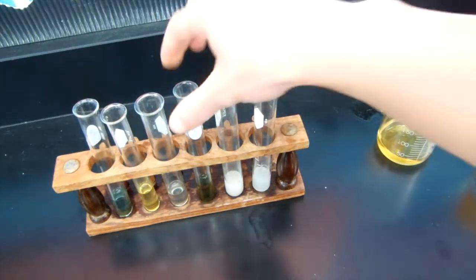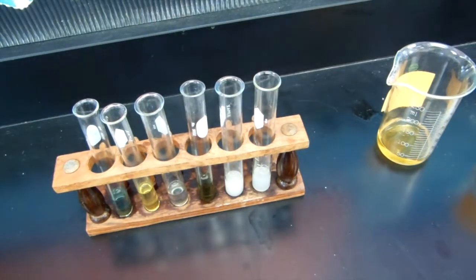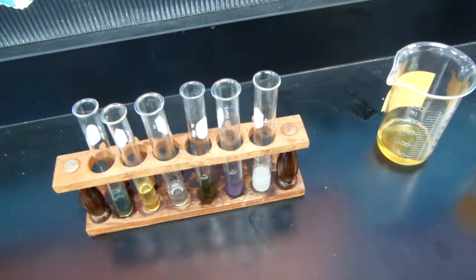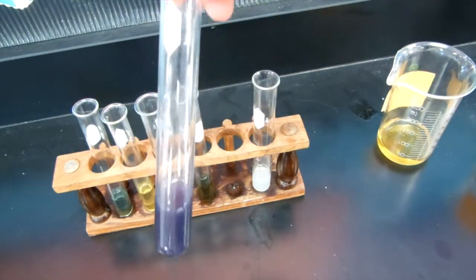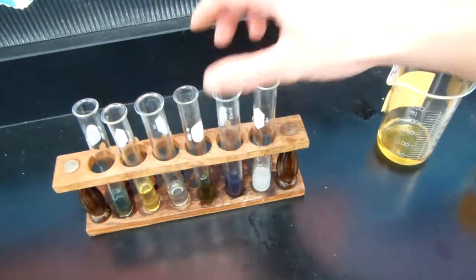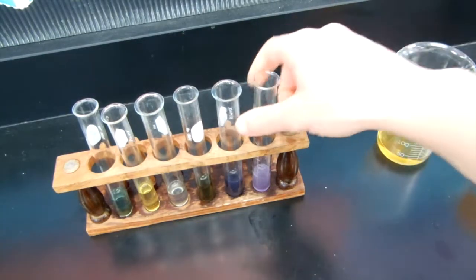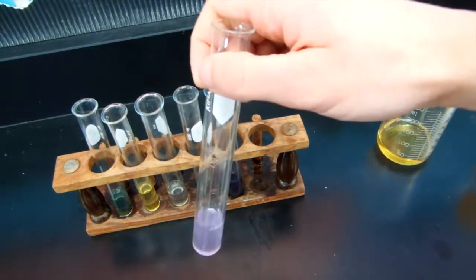This one activates with heat, so I'm going to go ahead and put it in the water bath, but mix that first. Then with the oatmeal water, the iodine goes with that. So you can record what color that one is. And then for the albumin, and then see what color that is.